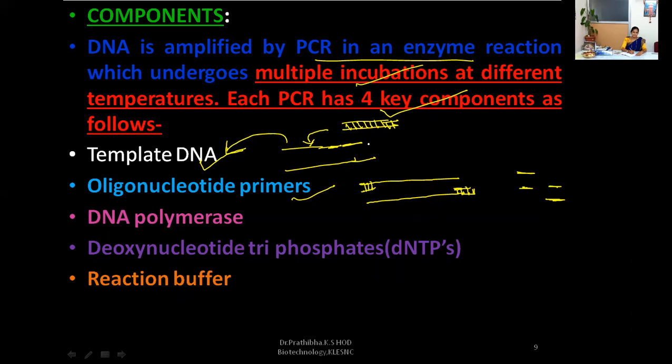So earlier, the hydrogen bonds of the DNA were broken down, then we got the single stranded DNA, which is known as the template strand. To this template strand, oligonucleotide primers go and bind on either end of the DNA fragment. Then DNA polymerase comes, the hero of this PCR. This DNA polymerase enzyme goes and sits wherever there is the initiation of a double stranded region.